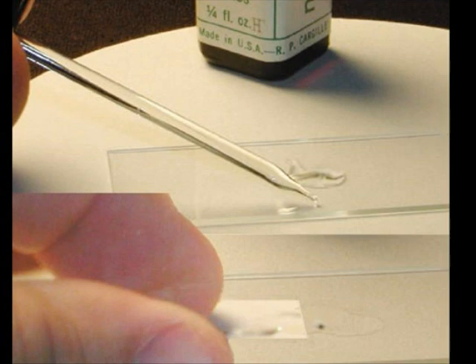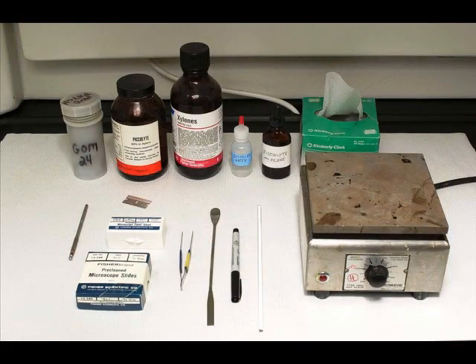Oil mounts, such as Cargille refractive index oil, allow for a clear observation of specimens with different refractive indices, easy manipulation and separation of particles, and problem-free transfers from one mount to another. These are best for particles, glass, and paint chips. In the end, it is the analyst's decision to decide which mounting medium, whether liquid, solid, water-soluble, organic, dry, or wet, will be appropriate to ultimately give great contrast in comparing trace evidence specimens.